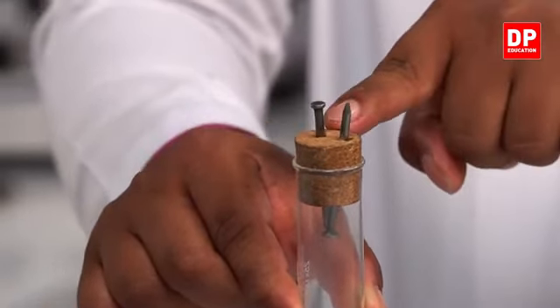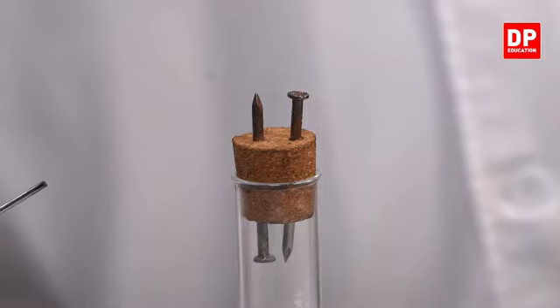So, my dear children, I kept this system for about 5 days. Then here is my system right now. Observe the system very clearly and check what has happened to the iron nails. You can observe clearly the top part has some amount of rust, right? The top part of the iron nail, which is in contact with the normal atmosphere, has some amount of rust.